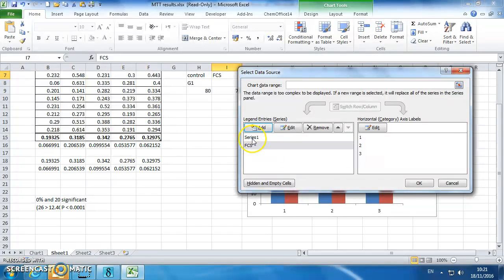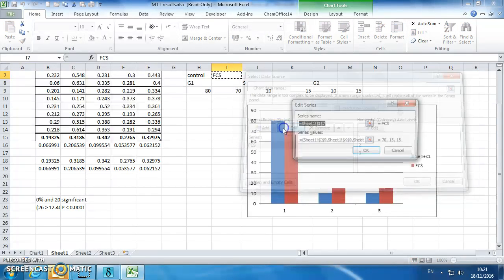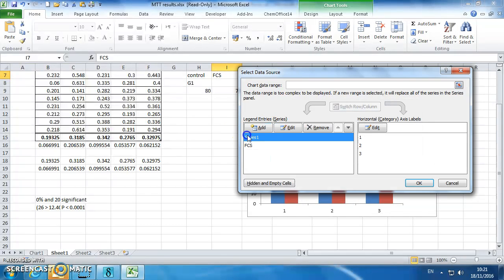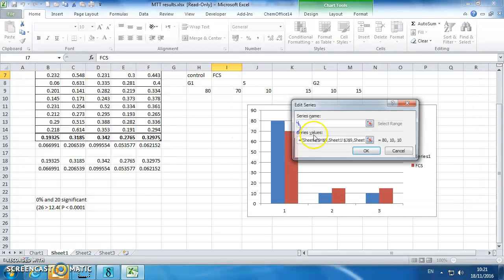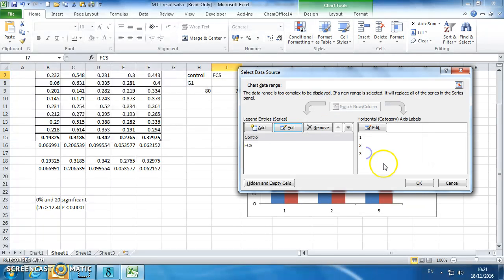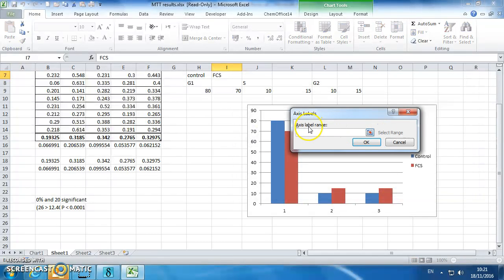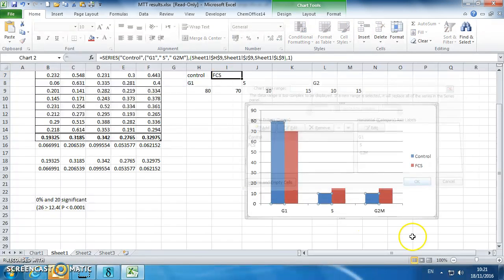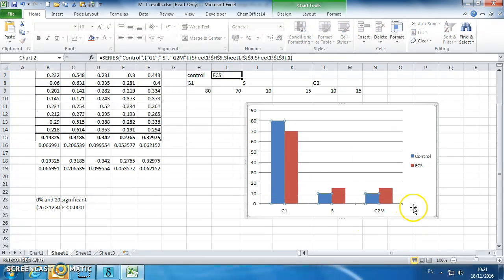I can edit the first series, call that control, and I can edit these data labels, as you should know, they're G1, S phase, G2, M. And we've now got a beautiful graph.